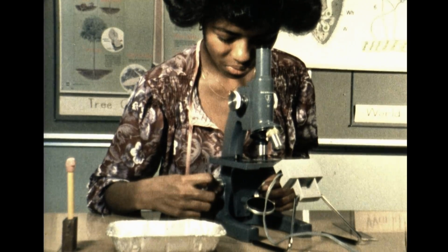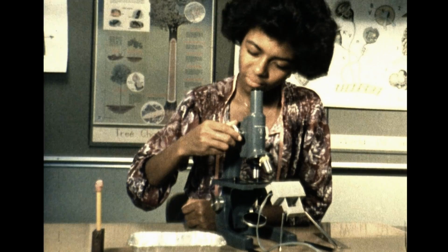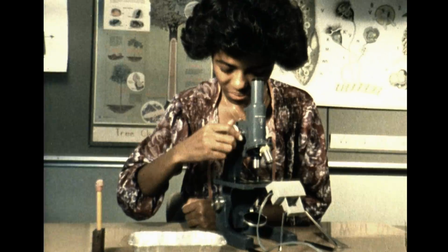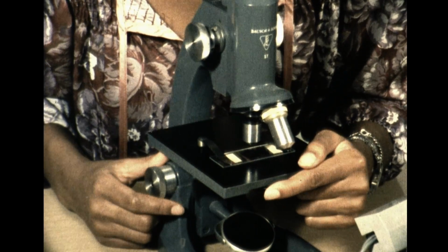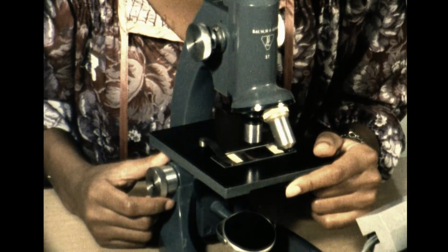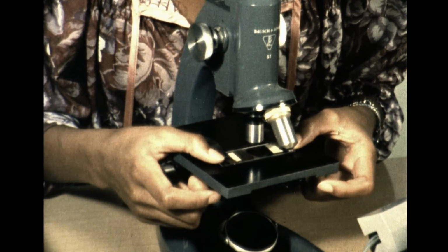10. Fine tuning will produce a sharp focus. It is possible to lose the focus in the process of fine tuning. Best thing is to go back to coarse focusing. It's easier to get into range. 11. Adjust the diaphragm to obtain the best amount of light for this lens and this sample. By moving the slide over the window, different sections of the sample can be viewed.